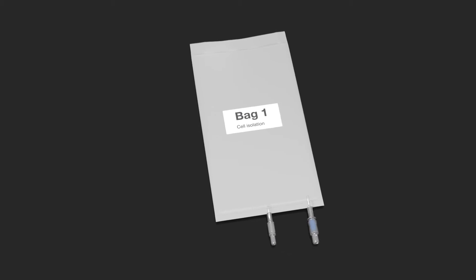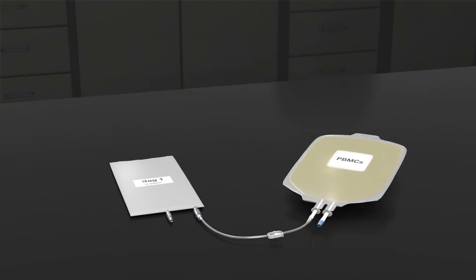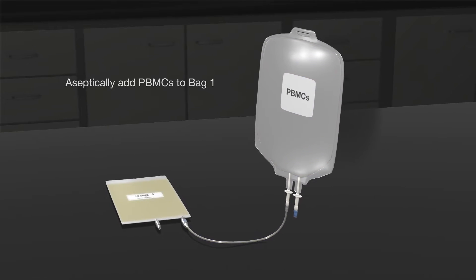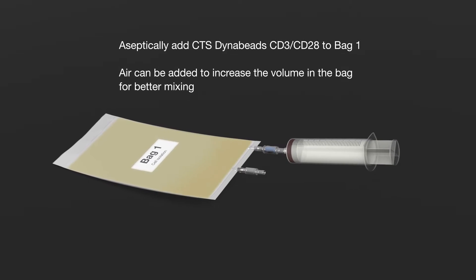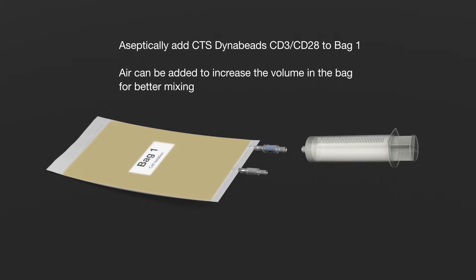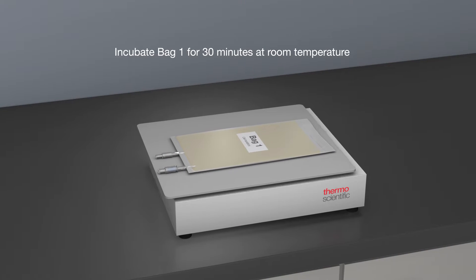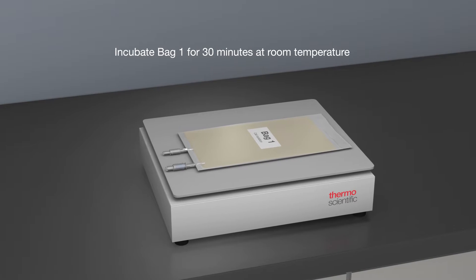Prepare a gas permeable cell culture bag — this is the cell isolation bag, or bag 1. Aseptically add the PBMCs to bag 1, then aseptically add the required volume of washed CTS DynaBeads CD3, CD28 to bag 1. Incubate bag 1 on the platform of a shaker for 30 minutes at room temperature to gently mix PBMCs and beads.